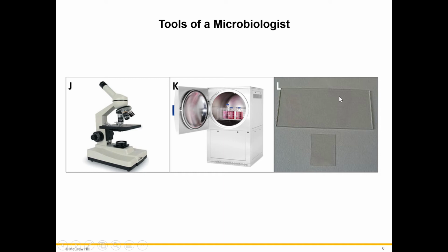And this one is a microscope slide with a cover slip. A microscope slide and a cover slip are used to observe microscopic organisms in a microscope.